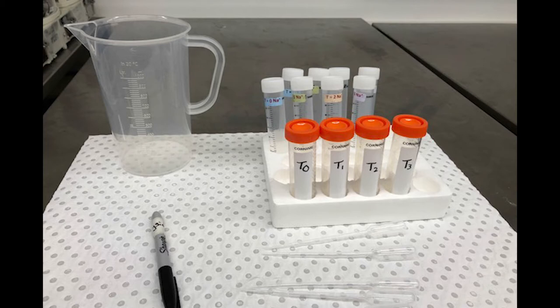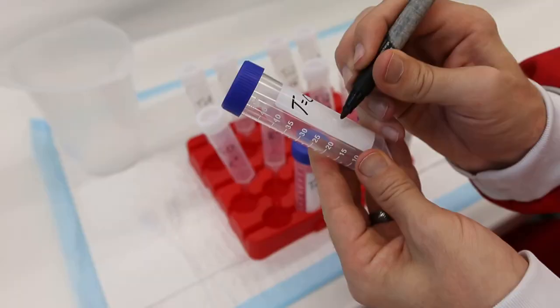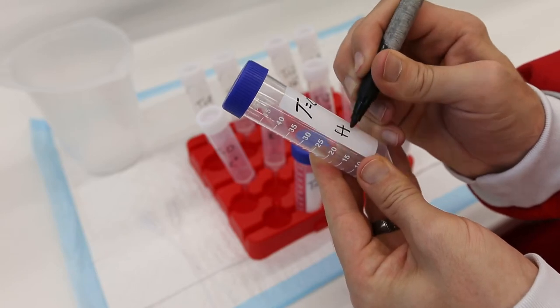For the 50 ml tubes, you will need to add the time point: T equals 0, T equals 1, T equals 2, and T equals 3 to each of the tubes respectively, and also add your initials to each of these tubes.